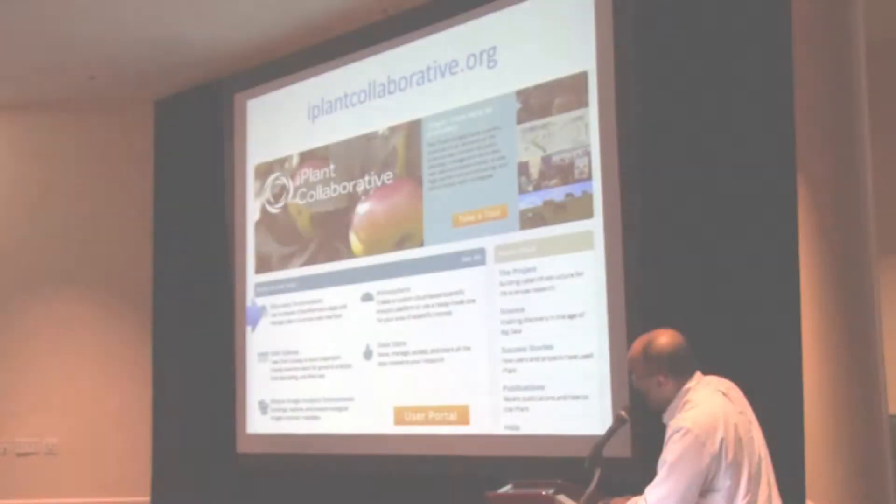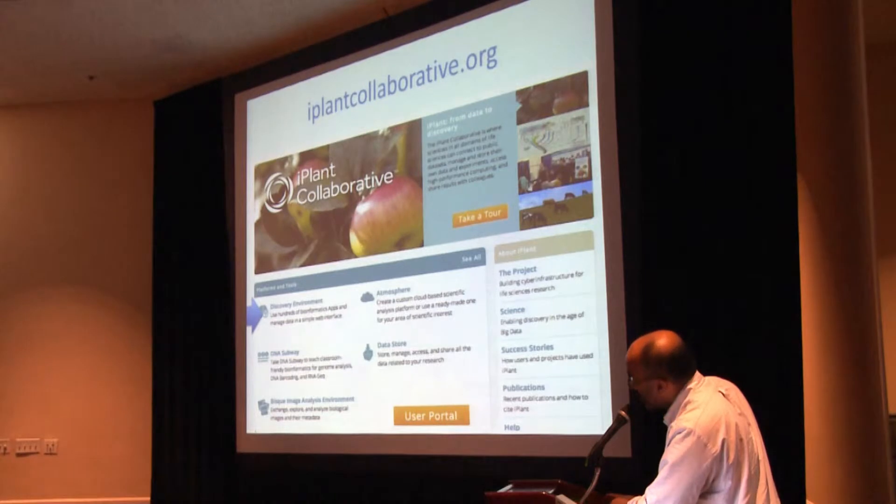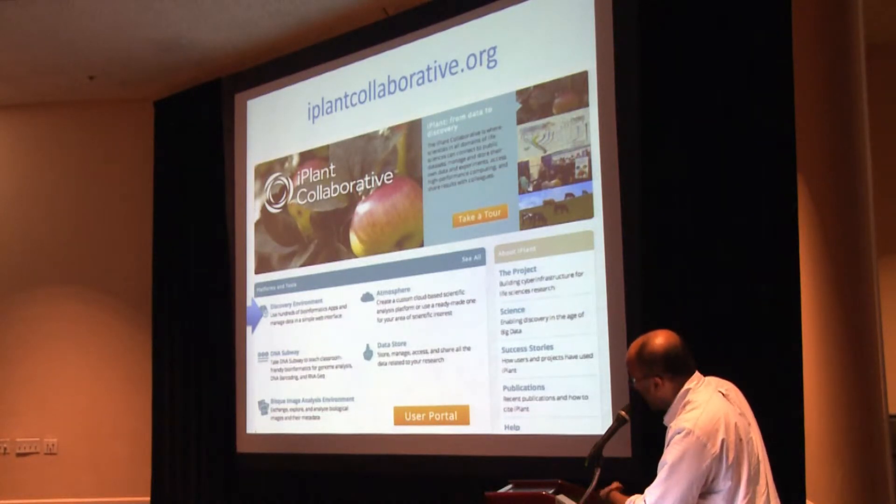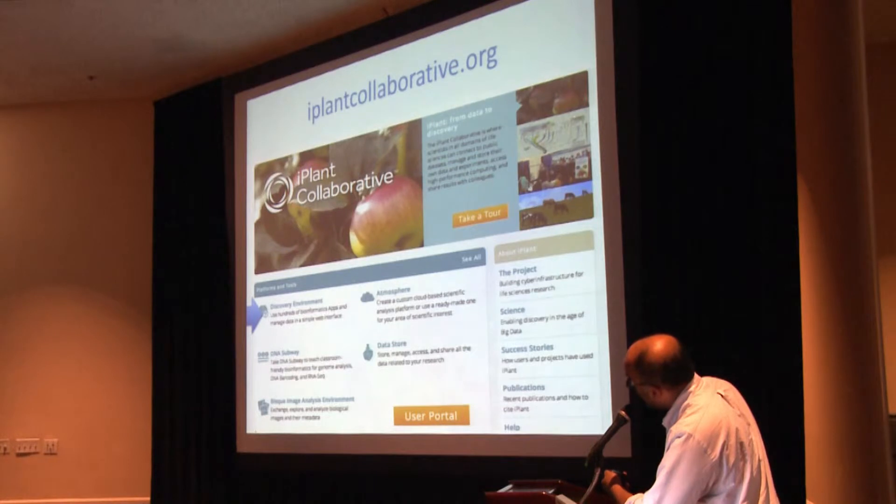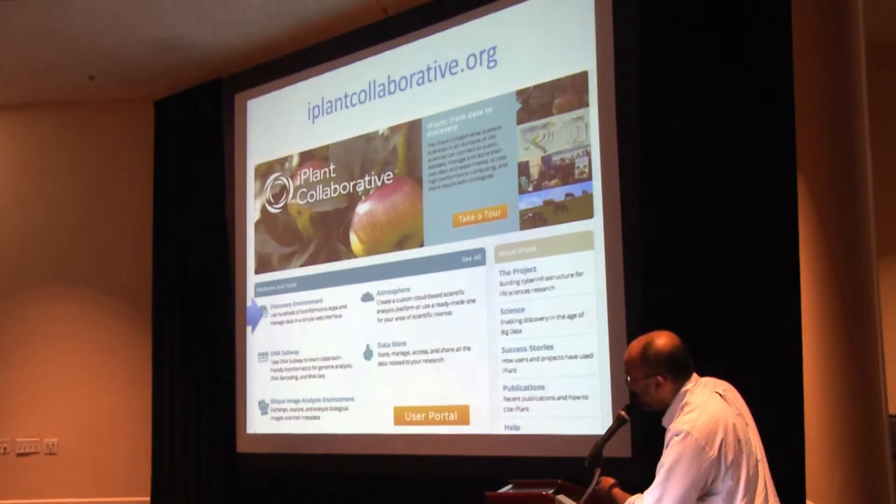So for those of you who are not familiar with where to go to access Discovery Environment, this is the front page of the iPlant Collaborative website. And that right there where the blue arrow is pointing, that's a link to the Discovery Environment.